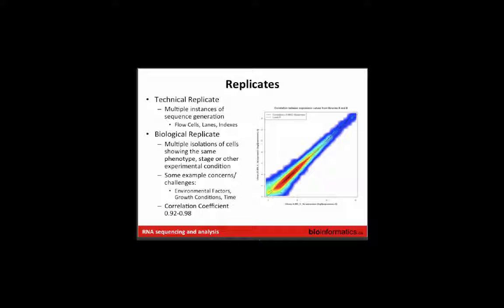So we spike our spike. Yeah. For example, we put a spike in, we freeze it, store it, process it, and make sure we get that back. Then we have another spike we put in after processing to make sure that spike shows up as well.